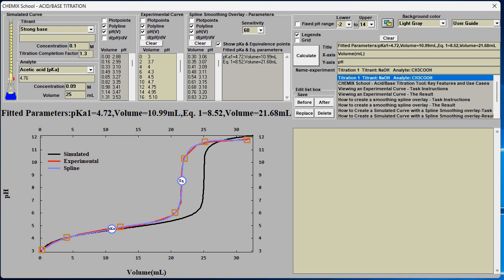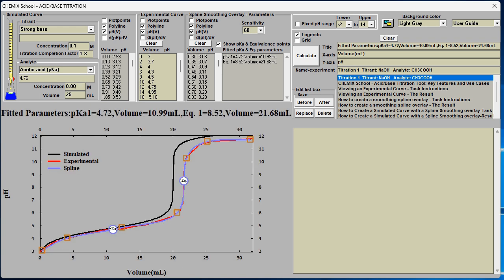In our first attempt, we reduce the concentration of the analyte to 0.09. We need to reduce the concentration even more. Our second guess is 0.08.